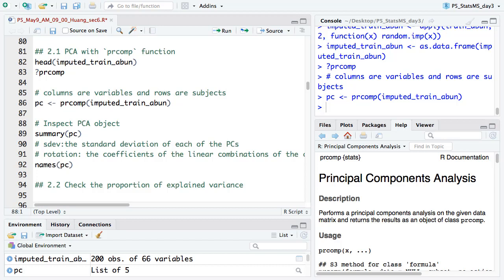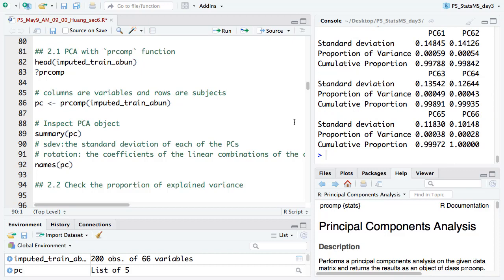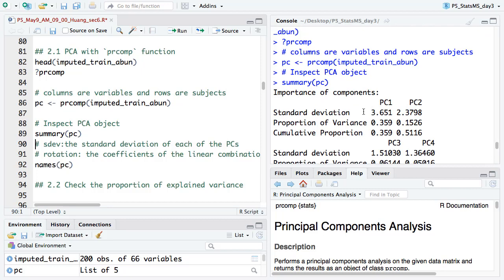That will give you the PCA result — it's very fast. As long as you prepare your dataset in the correct format, the analysis is quick. Usually the difficulty is getting the input data format right. We run PCA and use the summary function to see what it returns. Since we have 66 proteins, we will have the same number of components, ranked by their proportion of variance.